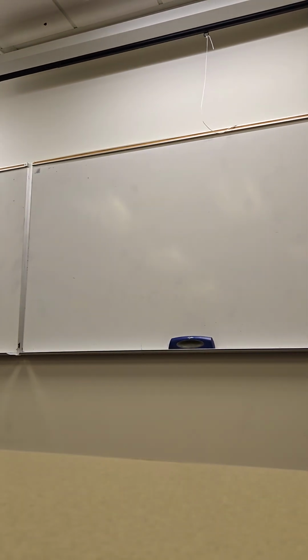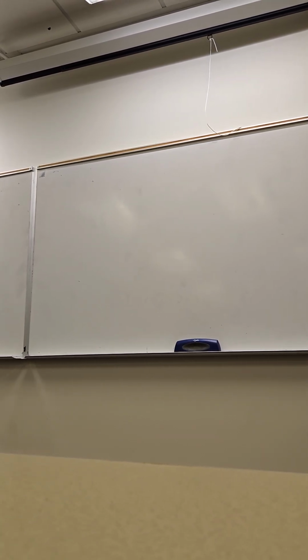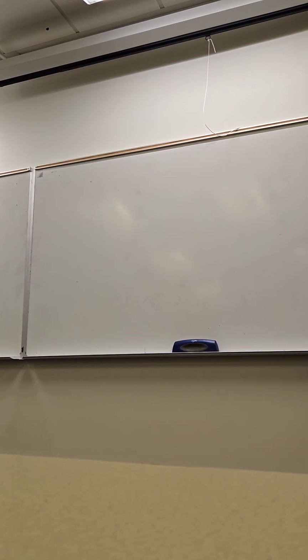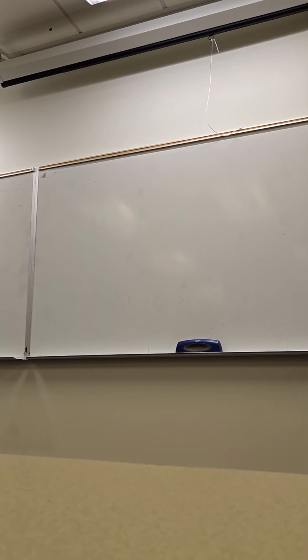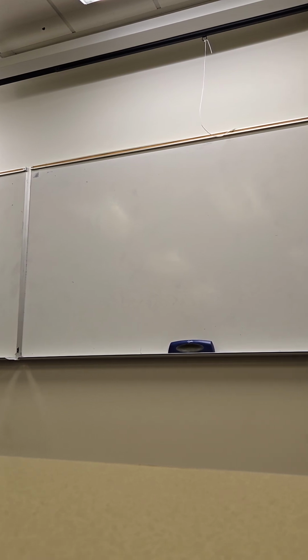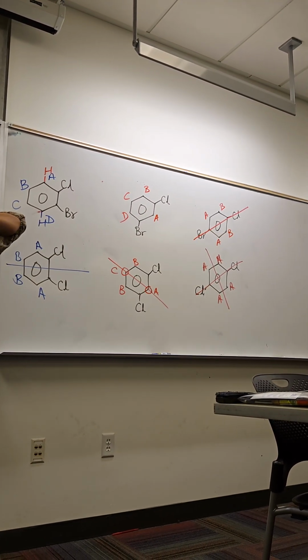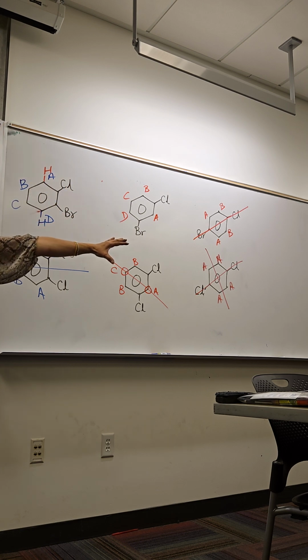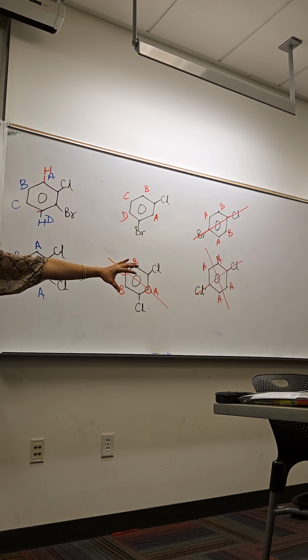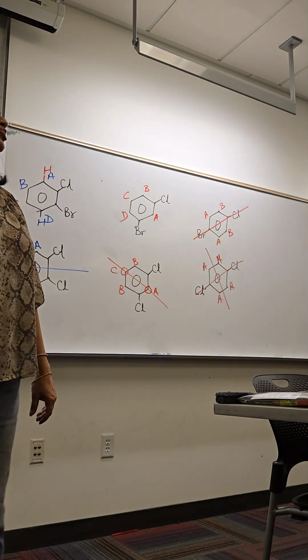Questions? Anything? If I stuck my hand in an NMR machine, would I get cancer? Great question. Ours, no, because ours is a very weak, puny instrument, which I wish we could replace, but we don't have the funds. But at UW or any big university, their NMR instruments are cooled with liquid nitrogen, because you really need to. And it's in a lead protected room where you should leave your credit cards and your keys outside. So in that case, yeah, just don't do it.